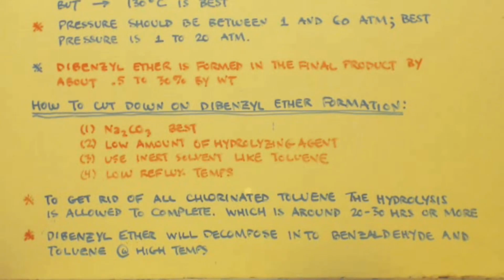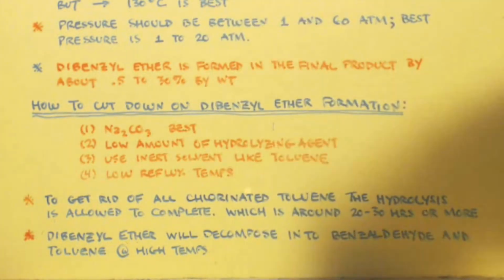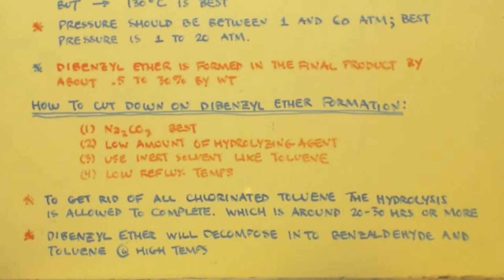And the last thing on this board, dibenzyl ether will decompose into benzaldehyde and toluene at high temperatures. So if you did mess up and you made a lot of this dibenzyl ether, I don't know what temperature or whatever, but maybe you can reflux it at a very high temperature, and then as it decomposes into benzaldehyde and toluene, it distills out. Maybe, I don't know. But you know as much as me by reading that statement, okay? But you might be able to get some of your product back if you did that.